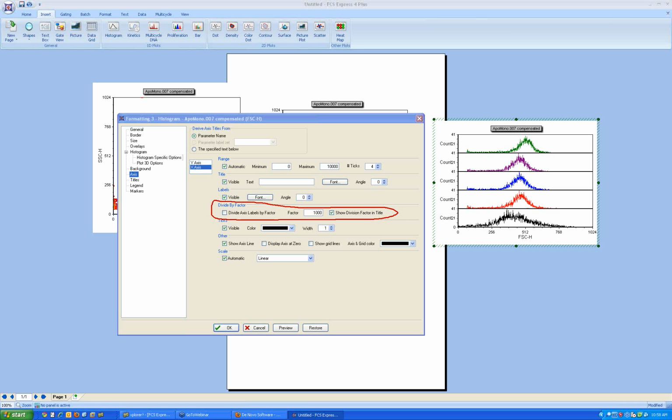Okay, and I do want to restate, we really do appreciate suggestions and comments from our users. When we were putting this together, we went back to our forums and back to our support and gathered every single suggestion that people had given us and combined them together and saw how many people suggested what, and a lot of it really went into this new version of the software.